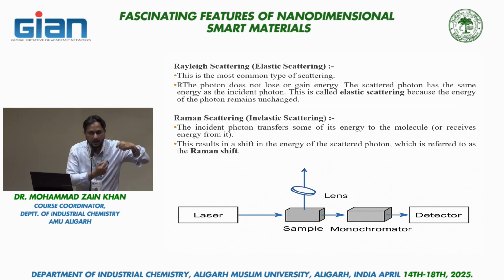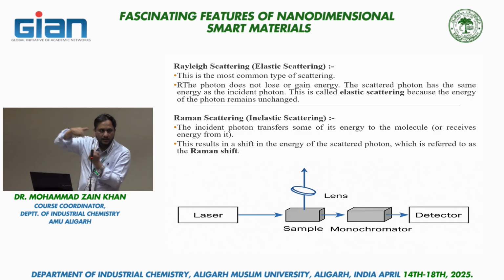Slits and something to break light. It may either be a grating or a prism. So for a monochromator, we need either a grating or a prism which breaks the light into individual colors, and then we have entrance and exit slits to select a particular wavelength of light while deselecting the others. So that monochromator is of course used, but the main components are the light source and the detector.